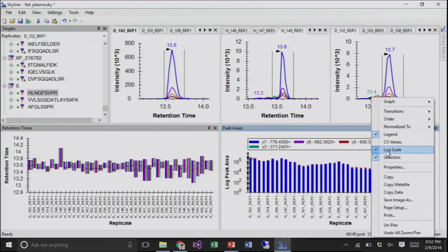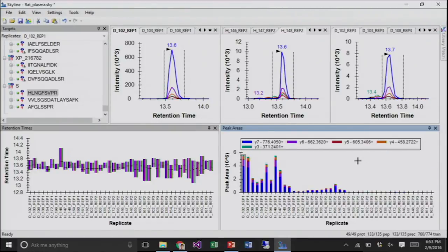I'm going to turn off log scale because it can be kind of confusing. So, 200-fold change. Do we think that's likely reflected in all the other peptides? Probably not. We've been looking at things where we definitely didn't see 200-fold change. So 200-fold change is anomalous for this data, and we should not use this peptide to normalize to, because everything else has some decline, but not 200-fold. So this is a bad choice for a normalization peptide.